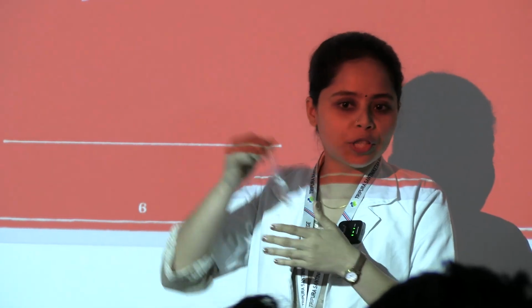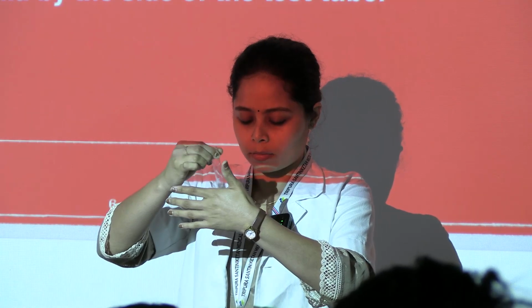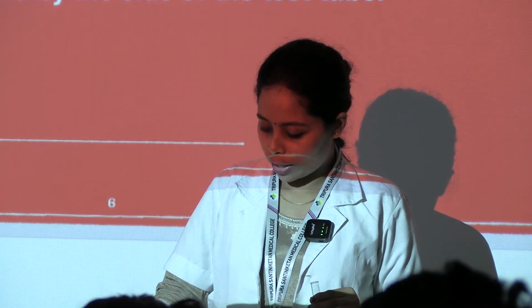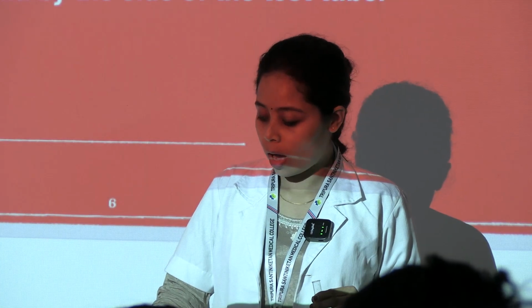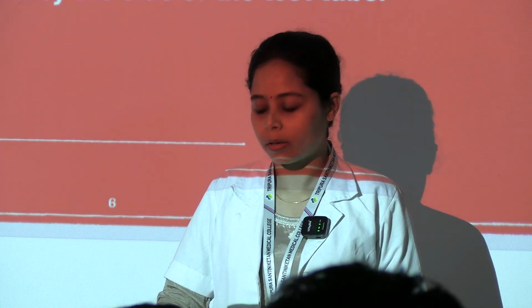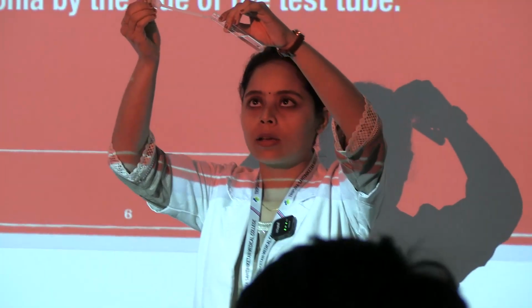Then you have to shake it. Yeah. After that 1 ml of liquor ammonia, by the side. That is very important. Okay, by the side, slowly by the side, like this.